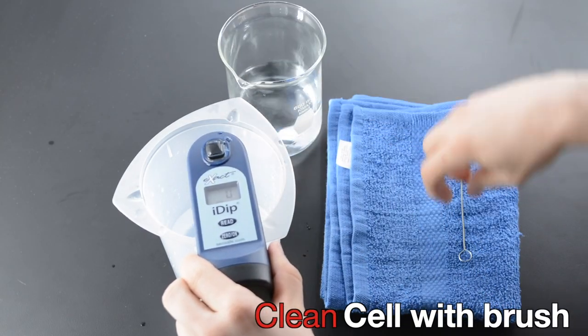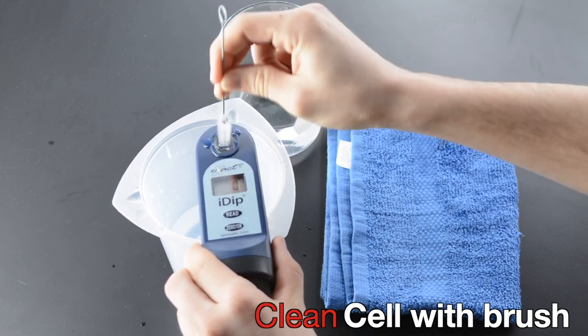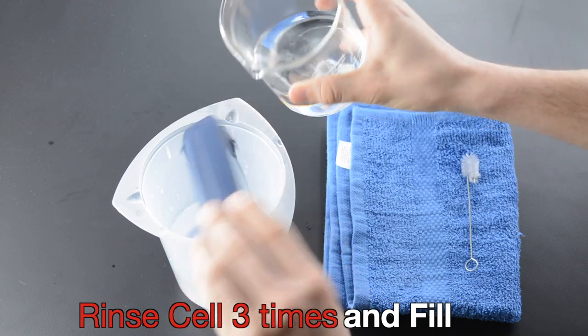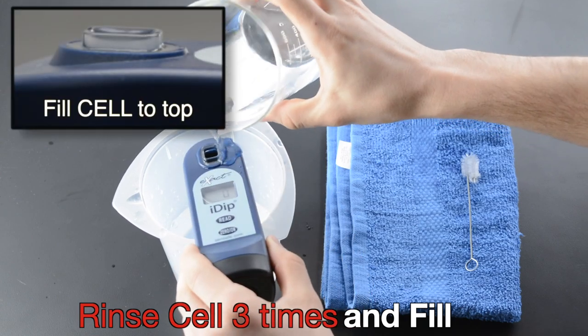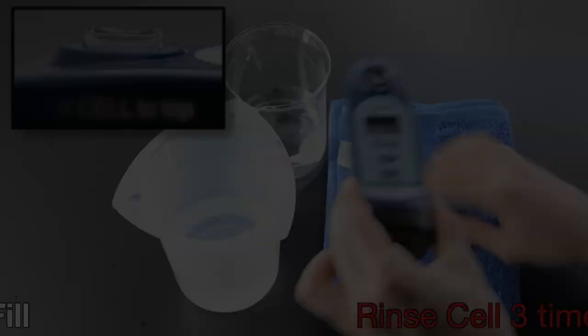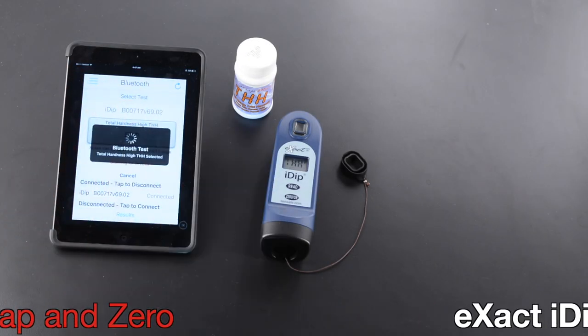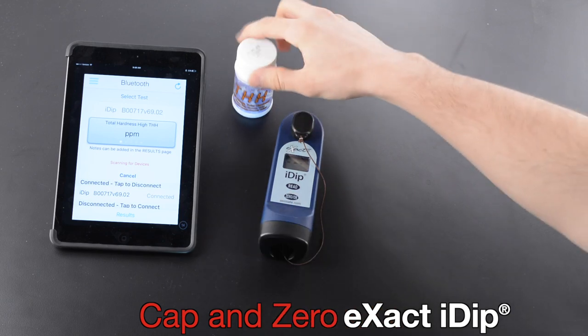Clean cell with brush. Rinse cell three times and fill. Fill cell to top. Select Test. Cap and zero XactiDip.